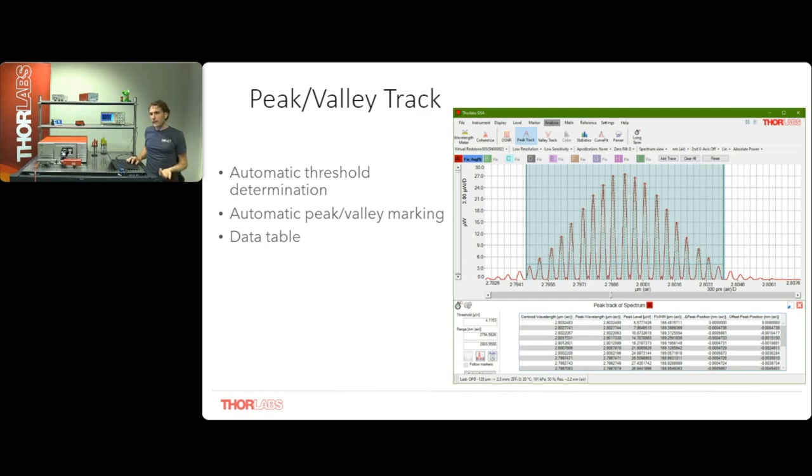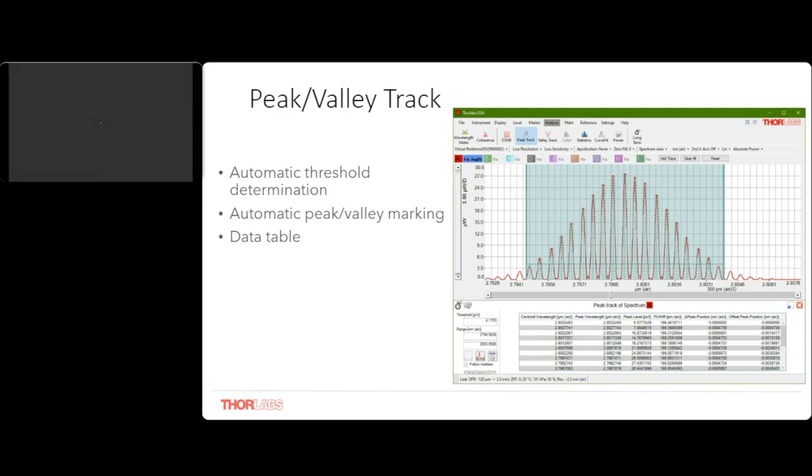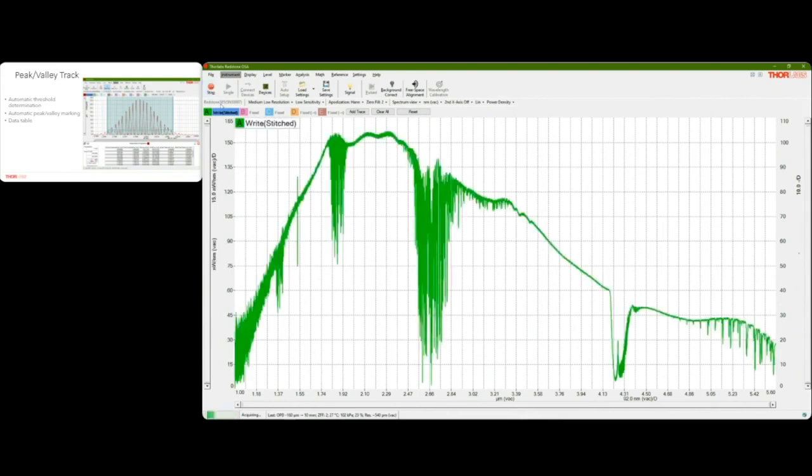And now it's time, finally, for the live experiment. For this, I will share my screen. I have started the GUI. So this is what it will look like when you start the GUI. And the first thing that we want to do is to collect a background spectrum. So I start measuring in repeat mode, continuous measurements. And this is now the spectrum of the SLS-203, the red lamp that we have here.